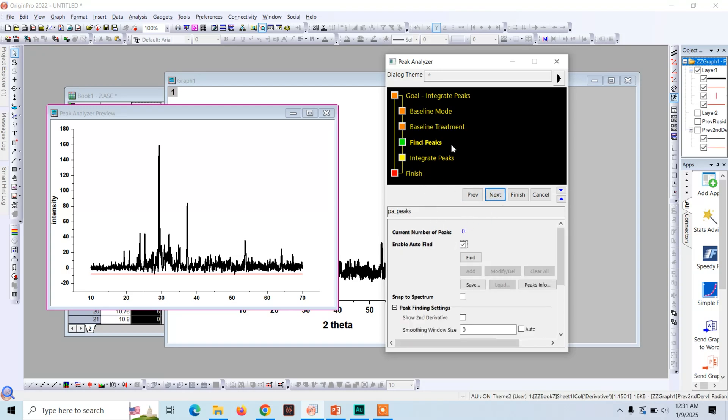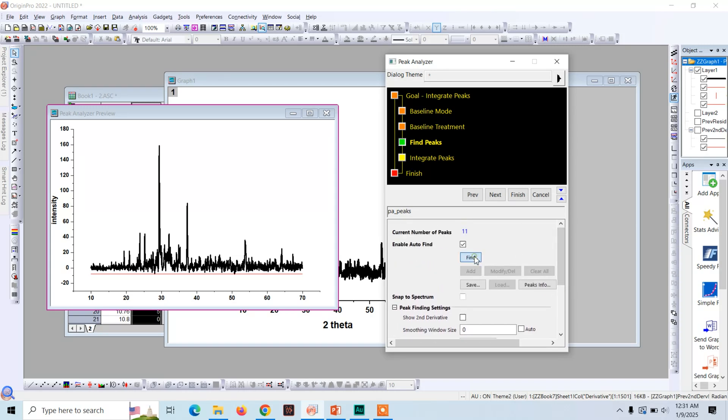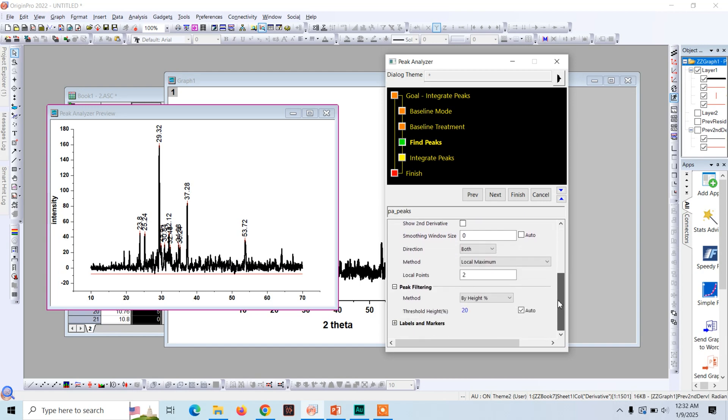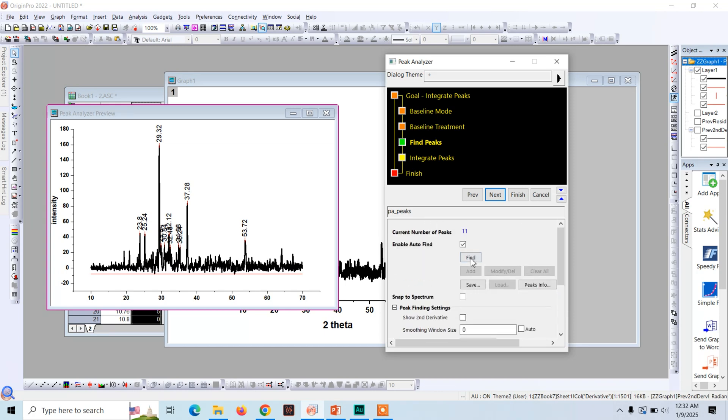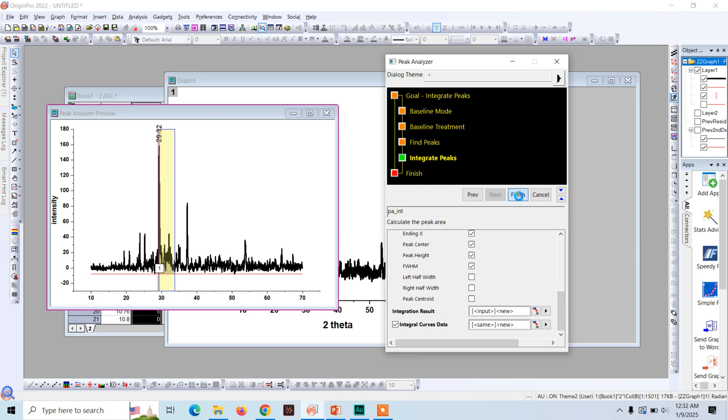Now click on Next, click on Next. This is baseline, select the Asymmetry scale. And here is Find the Peaks. The threshold height is 20 percent. So let's click on Find. It shows us 11 peaks, but here just for the demonstration we will use a single peak. So increase the threshold to 60, and now let's see how many peaks it is going to show us. Now it shows us only a single peak here at 29.32 degree two theta position. Now click on Next.